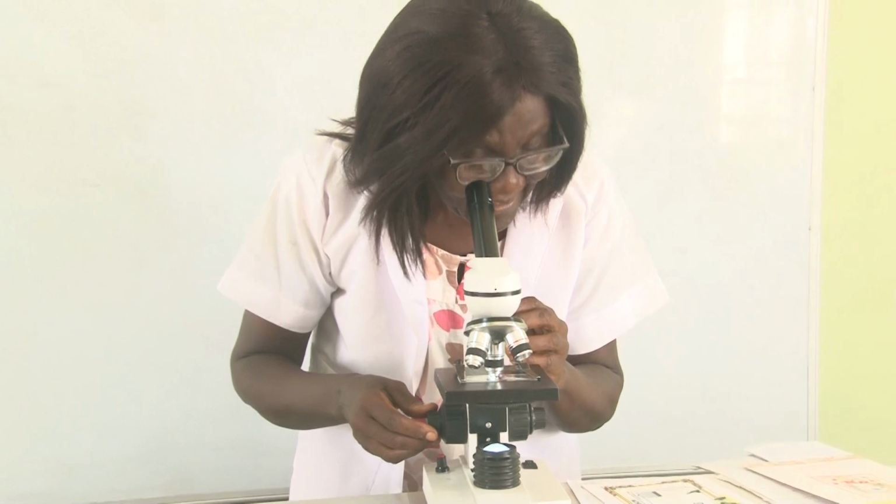Very neat. That is oil immersion work and high power, so that you see the specimen very clearly. Neat, isn't it?